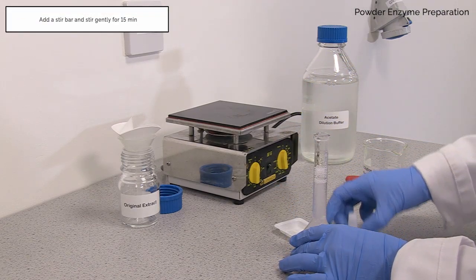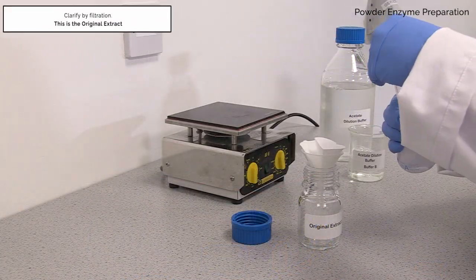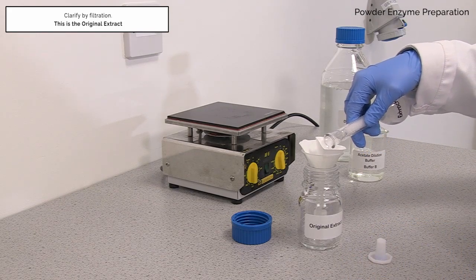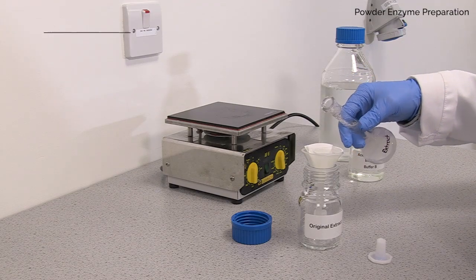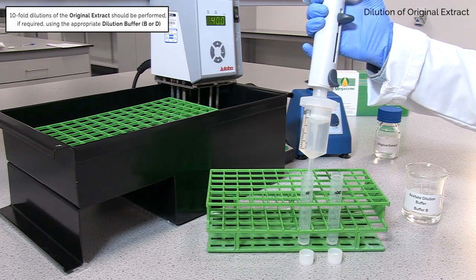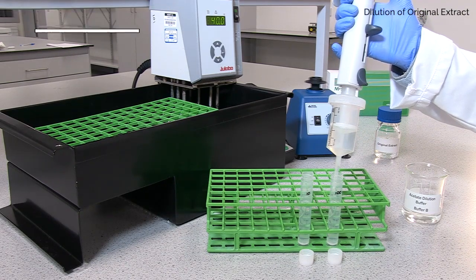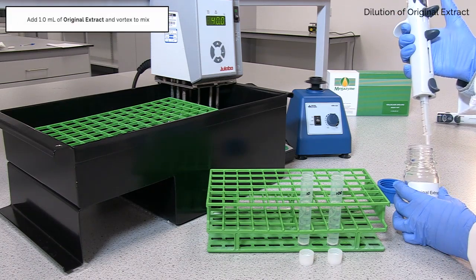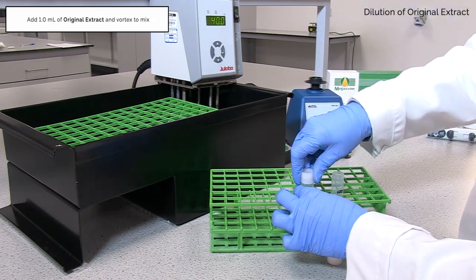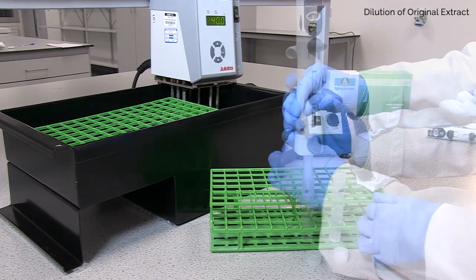Add a stir bar and stir gently for 15 minutes. If a tenfold dilution is required, add 1 ml of original extract to 9 ml of appropriate dilution buffer in a suitable polypropylene tube and vortex to mix. Tenfold serial dilutions can be prepared in this manner.